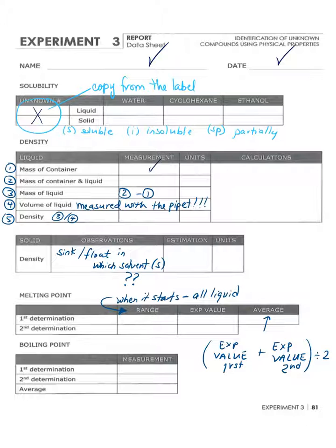And it's 10 milliliters because you're using your pipette, and the pipette measures 10 milliliters. So you have to make sure that you're using your pipette in a proper way, and that the volume you're taking is the volume that the pipette allows you to measure. So you're transferring those 10 milliliters into the beaker that you have on your mass balance. And now you're going to have a new mass, the mass of your beaker with your liquid inside.